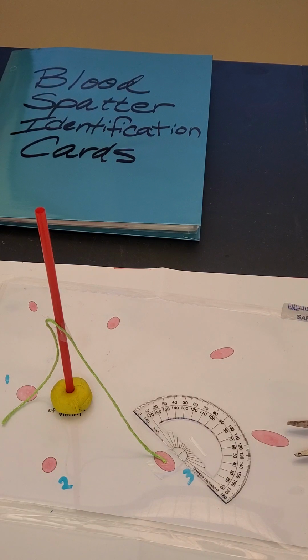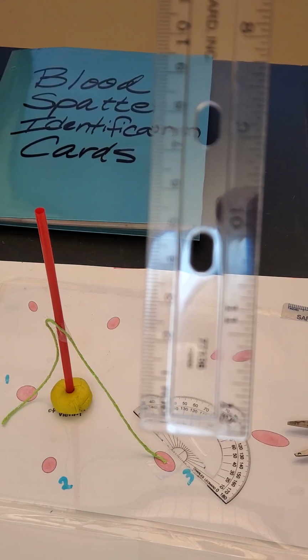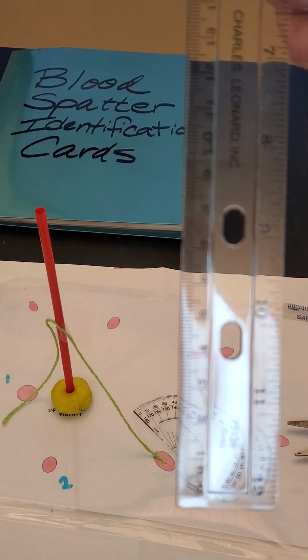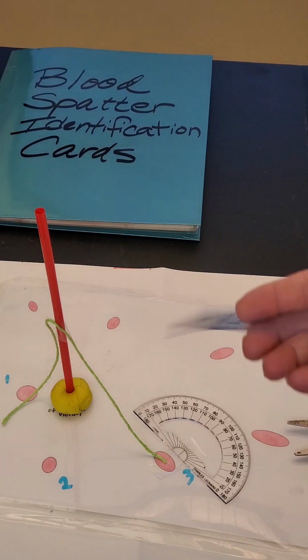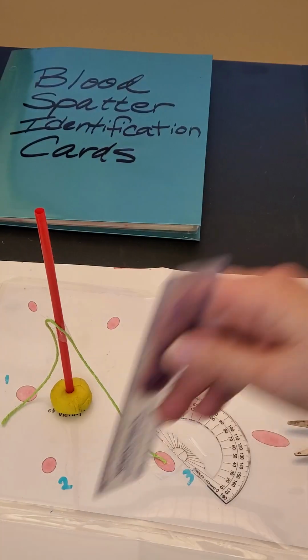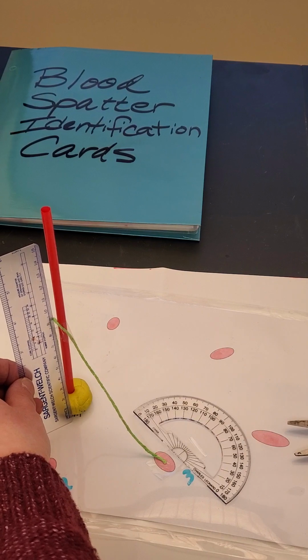Because on the lab itself, it says get the width, get the length, get the impact angle, and then what is the height on the straw? Now, you don't want to really use this one. The reason is it doesn't start at 0. See that? So we need one that starts at 0 or closer to 0, or you're going to have to go backwards, or add on. So you want to figure out how tall that is. What's the height? That's about 9 centimeters.